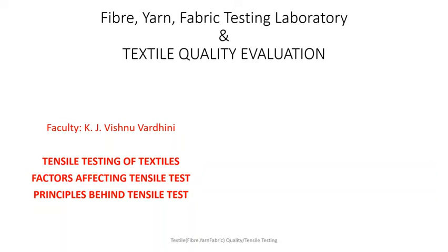Welcome, you all. We are trying to understand tensile testing of textiles. In this current lecture, we will try to understand the various factors that affect the tensile test and the principles behind the instrument in which the tensile test is being performed.